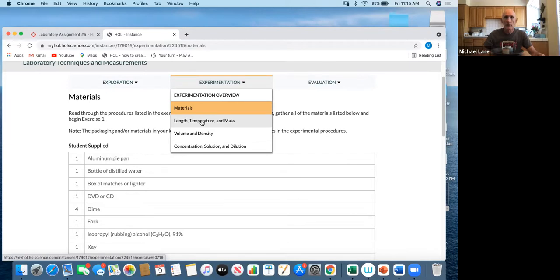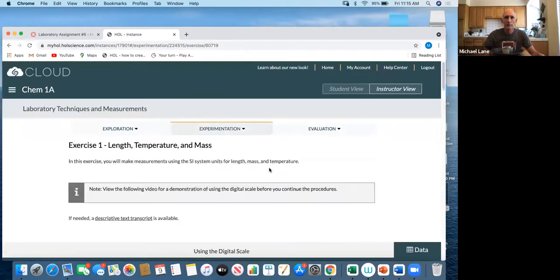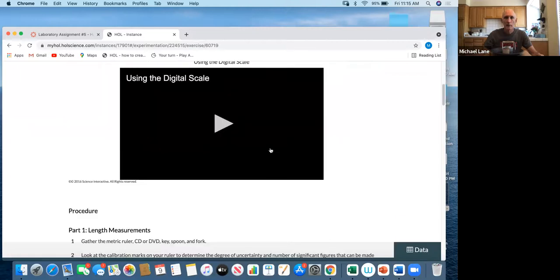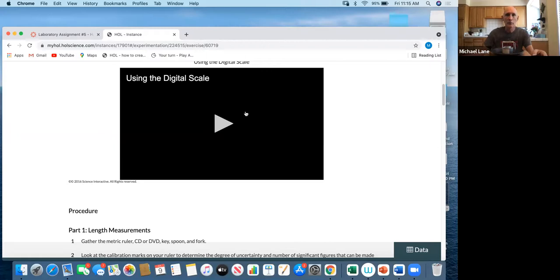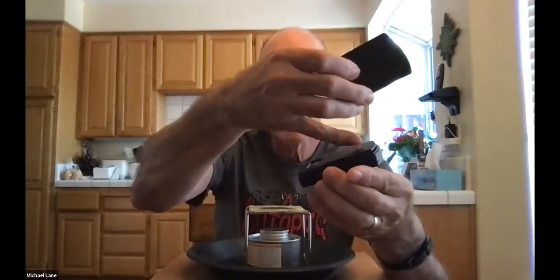Let me go to the first one: length, temperature, and mass. You can watch this video, but there are a few things I need to talk about with regard to the scale. This scale, or one very similar to it, has been provided to you. Notice that there's a cover on it to protect the balance pan from damage.